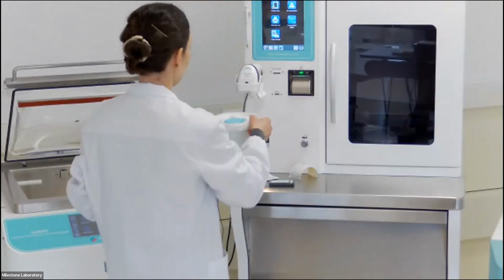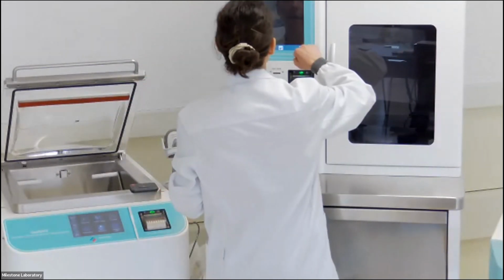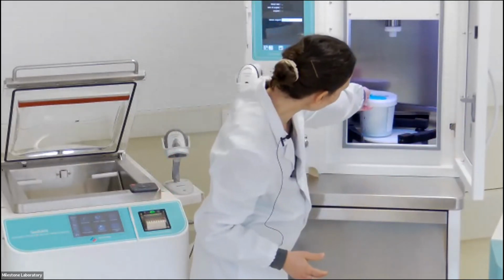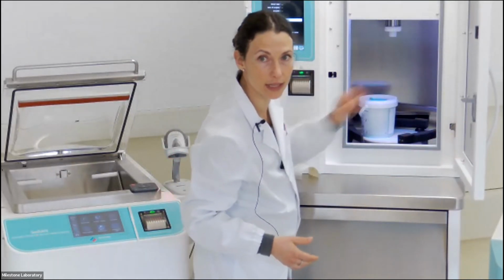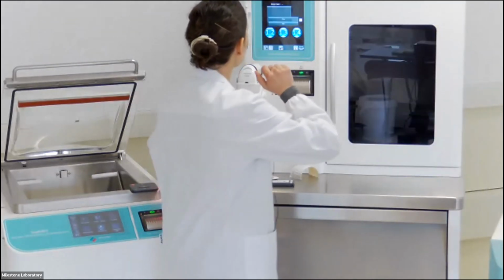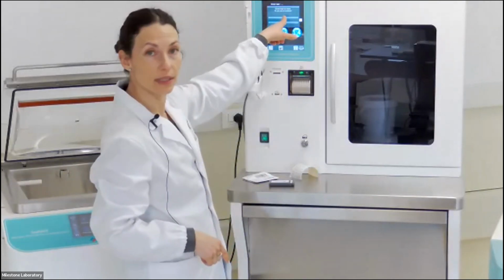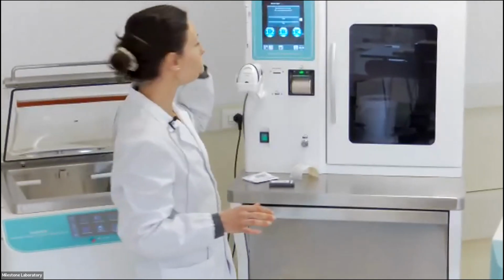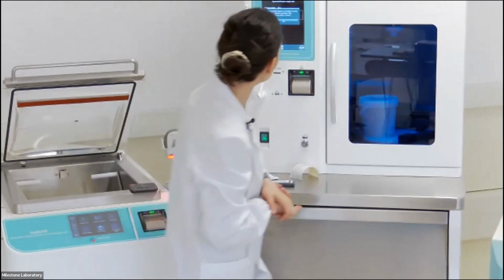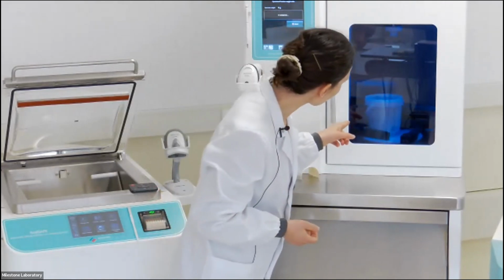So now, just start a run. Open. I will show you that I will insert the bucket not in the central part. So you can see the spindles, how they act. First message: bucket may be empty. Do you want to continue? So we know already from the scale that probably the process will not be fine.